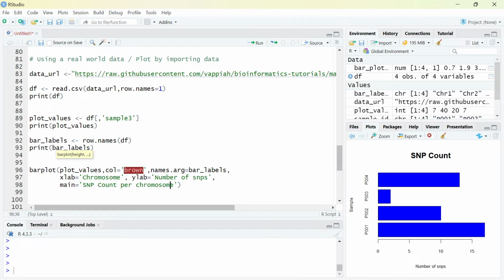Okay, if you use double quotes like this, then this place should also be double quotes. So you should have something like this. And then you can run it. So let's run the command. It is a single command. So let's run it, and then let's see.